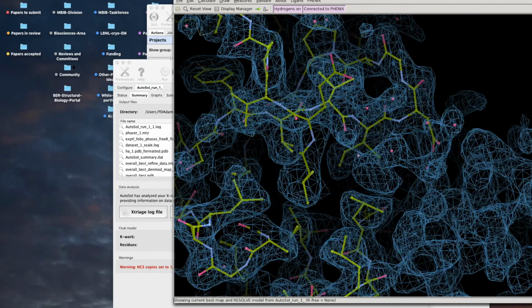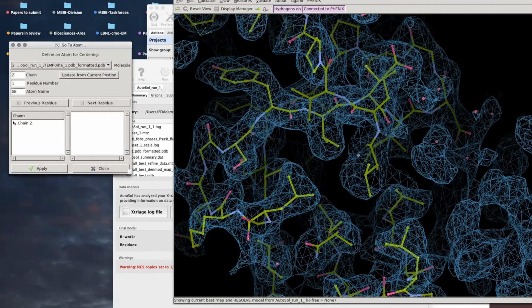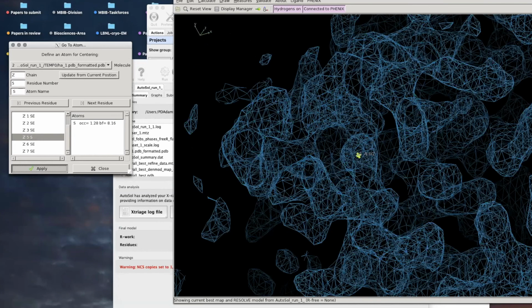We won't hear that much detail about experimental phasing from Phaser; you'll hear about molecular replacement shortly. Phaser finds the sites in this experiment. The way it finds sites is it asks the question, if I put a site here, how consistent would the anomalous differences that I got from this site be with the experimental data, averaged over all possible configurations of the protein part?